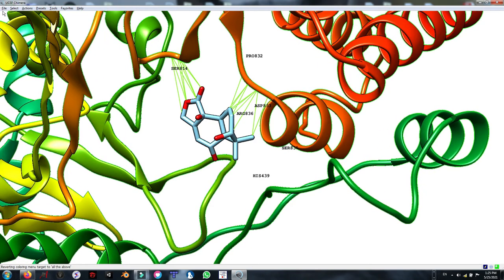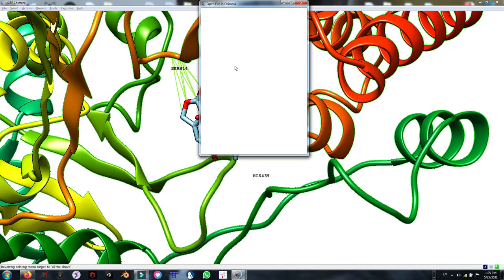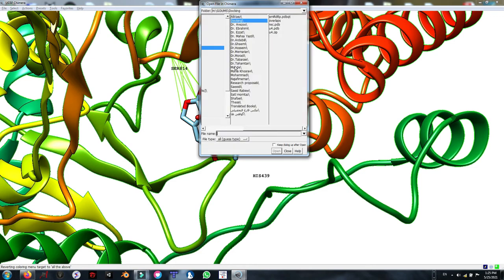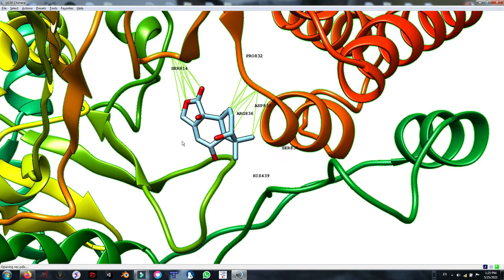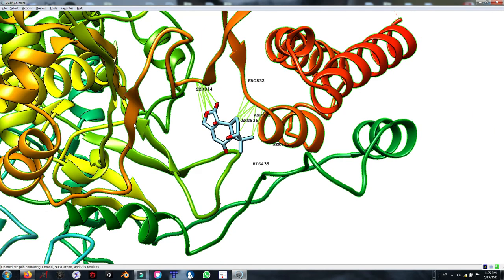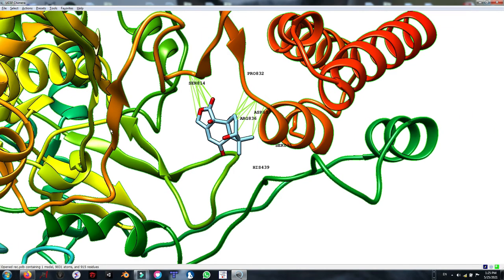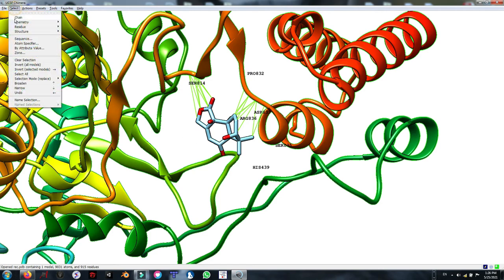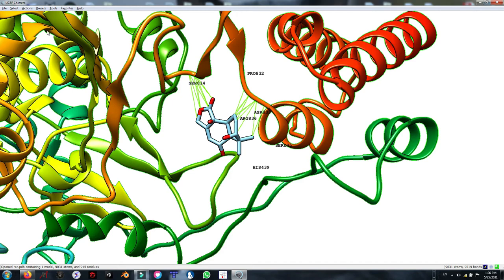In the next step, I am going to open another receptor file. No change can be seen in here because they are fully overlapped as the coordinations are the same. But here in the chain, we can see we have two PDB files. I am going to select the second receptor or the first one.